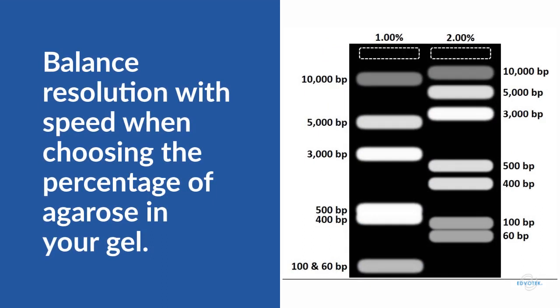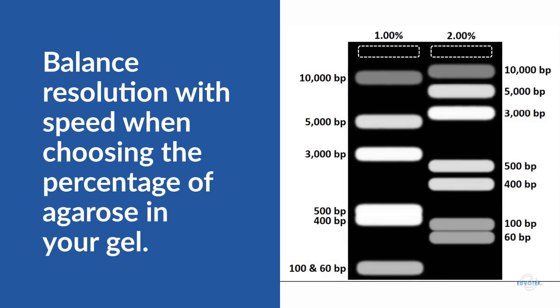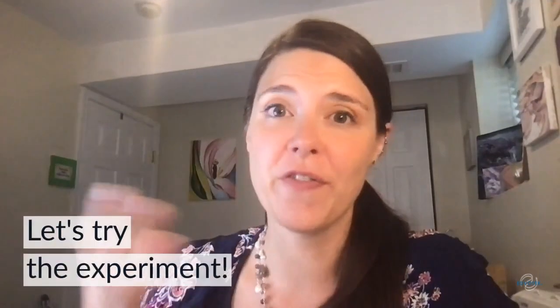Higher percentage agarose gels do take a bit longer to run because the tunnels through the gel are smaller. But if we have a mixture of small DNA fragments, we might choose to use a high percentage gel to get better resolution between the bands. When choosing a gel percentage for our experiments, we balance resolution with speed. So here's the fun part — let's try the experiment! What happens if I run the same DNA fragments on a high percentage agarose gel and a low percentage agarose gel?